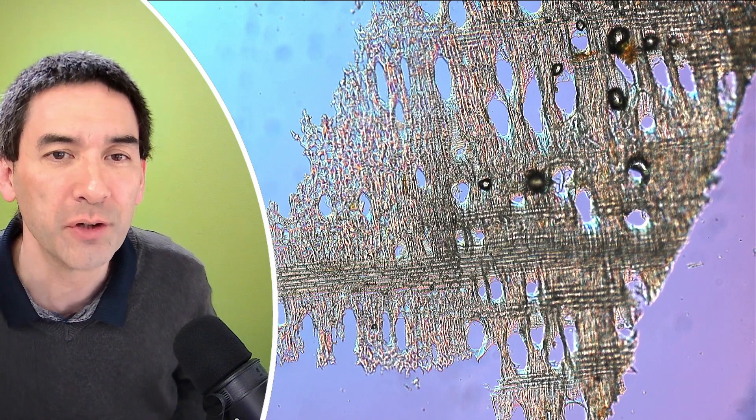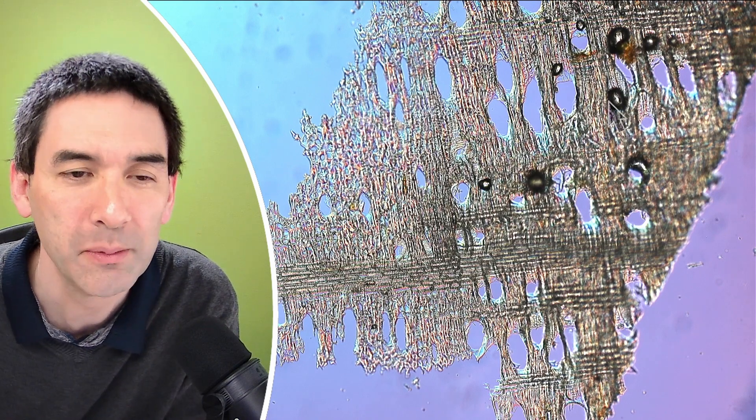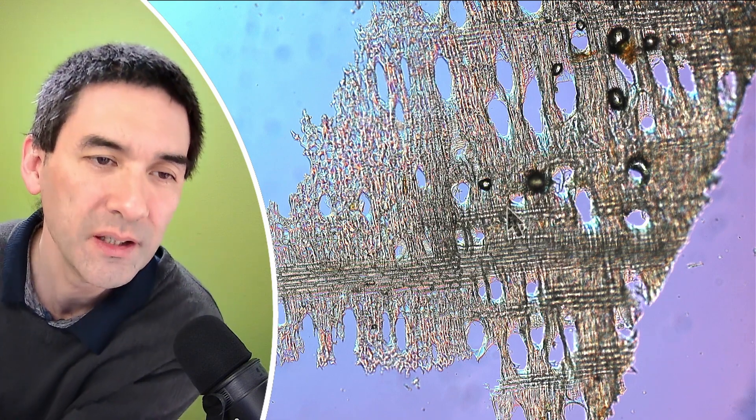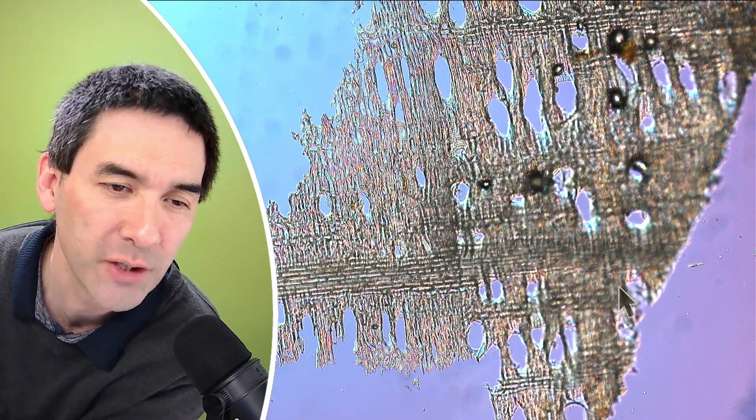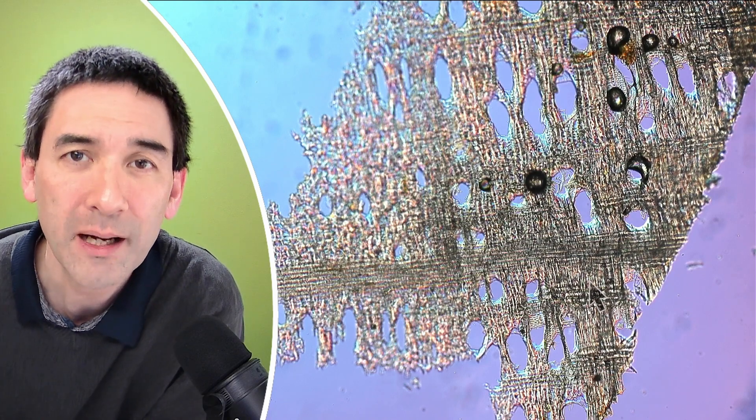What are we able to see over here? Those dark round structures here, these are a few air bubbles that are left over. You can also see that there are different cells running crisscross into different directions here. I just need to refocus here a little bit. Let's go up with the magnification.